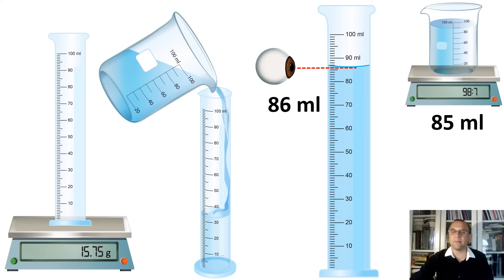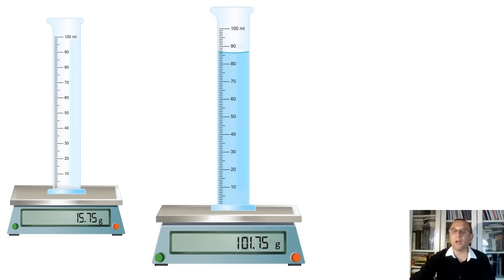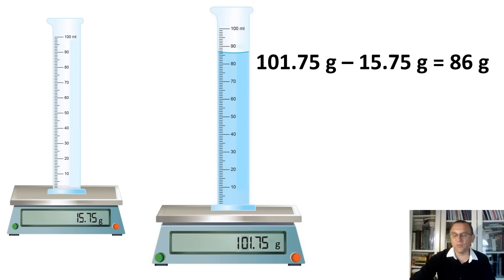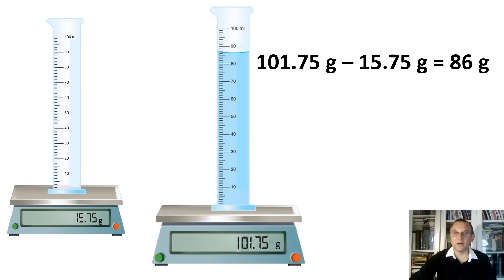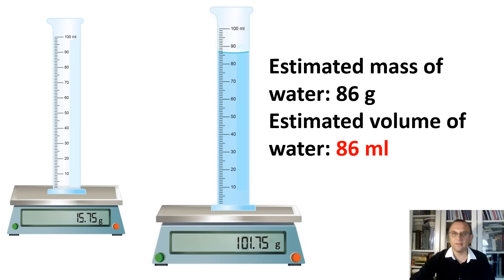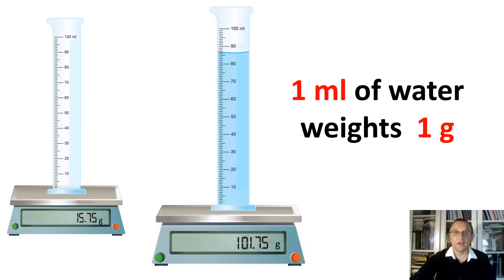By looking at the beaker, we estimated it as 85 milliliters. Now let's find the mass of the graduated cylinder with water — it is 101.75 grams. To find the mass of water in the graduated cylinder, we subtract the mass of the empty graduated cylinder from the mass of the graduated cylinder with water, and we end up with 86 grams. The estimated volume of water was also 86 milliliters. Pause the video and think about what this means.